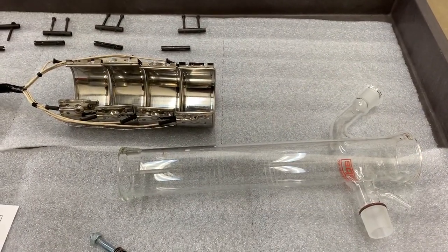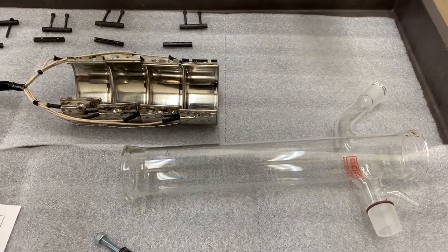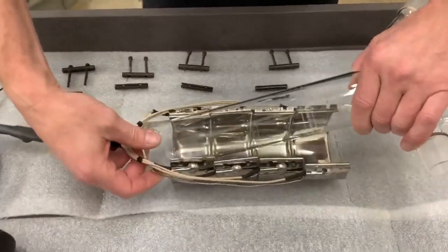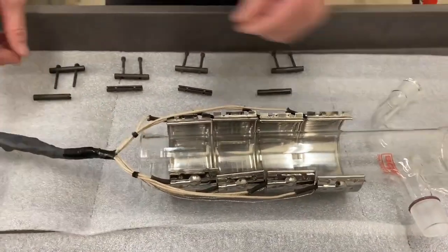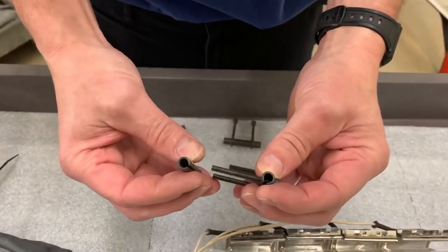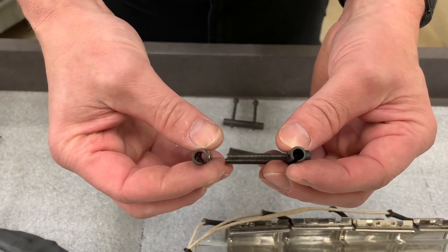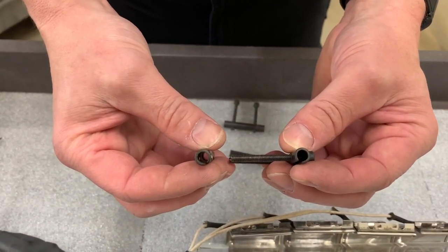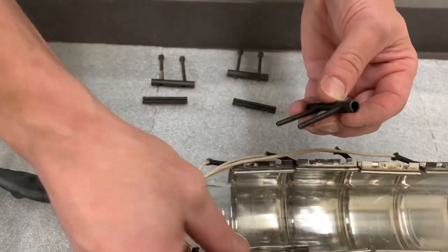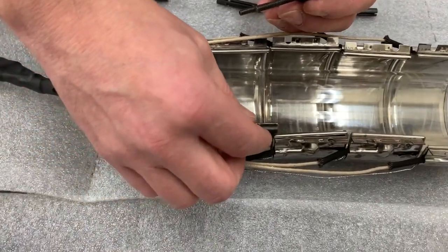I'm going to turn it over to Dave, who is actually going to do the band heater installation. First he's installing the glass, then he's going to grab all the parts. The parts here need to be oriented correctly — if they're not, you're going to end up damaging the actual pieces that are installed. You can refer to your manual, which will go through this in quite a bit of detail.